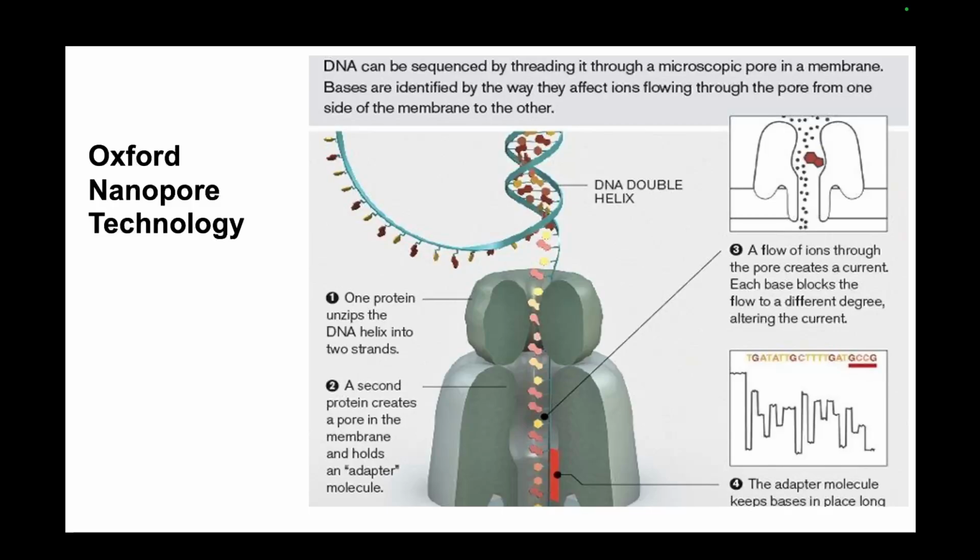So for example, in the first stretch, this nucleotide comes along and the change of current is say 0.2 ampere. I am just telling you random units here, just for example, so do not take these as original units. So for example, for your A, when there is an A inside the protein, the ion current flow change will be around say 0.2 ampere. If that is a C, maybe it's 0.5.